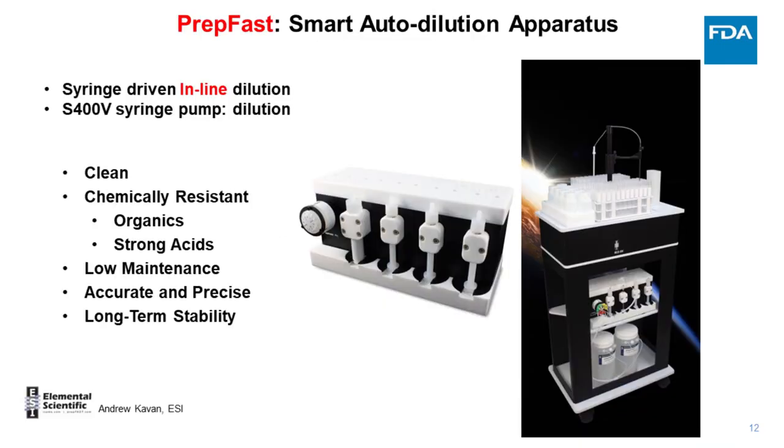Let me now introduce the smart autodilution apparatus, which is called PrepFast. It has been manufactured by Elemental Scientific, an ESI company in Nebraska. It is a syringe-driven inline dilution apparatus, as shown on the slide. On the extreme right is the figure. At the bottom, you have your rinse solution and your diluent, and you have the syringes, and the top rack is where you put your samples and your standards.